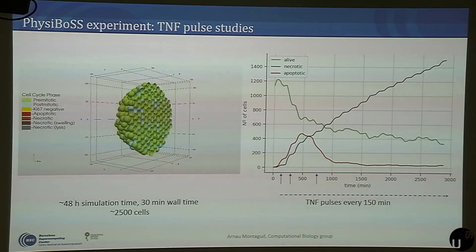Okay, well, what was pictured was basically the video of this graph, in which you see that the black cells are taking over the green and the red. So you still have this pulse of apoptosis, and the apoptotic cells have a very fast first state in which they shrink, and then they stay shrunk for a long time, which is why you have this long tail. But then you see that the black ones are taking over the green ones. Sorry for the video, maybe this afternoon we'll be able to see them.